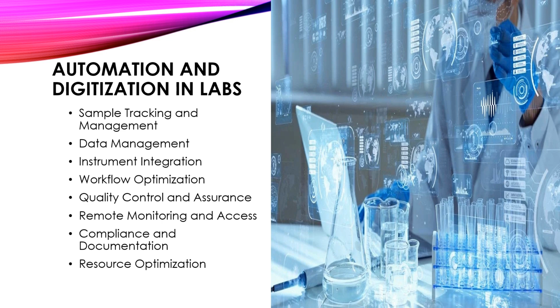Data management. Digital systems facilitate the management of vast amounts of data generated in the laboratories. Electronic lab notebooks (ELNs) replace traditional paper-based methods, enabling researchers to record, organize, and share experimental data in a secure and accessible manner. Integration with laboratory information management systems streamlines data capture, analysis, and reporting processes.